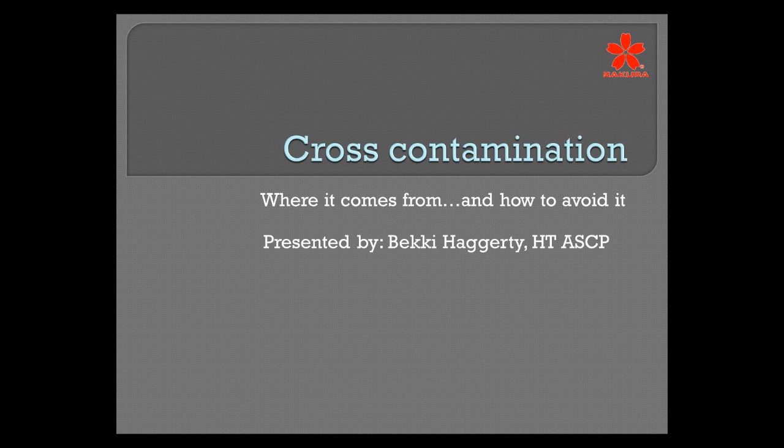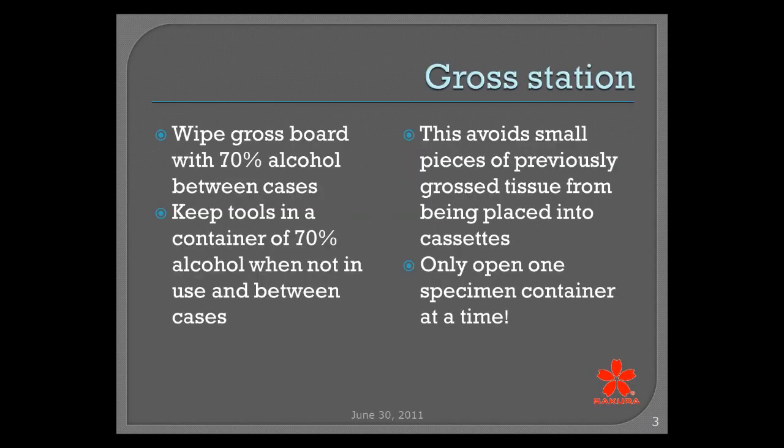I'm going to talk about cross-contamination and tips to avoid it in the histology lab. So we're just going to go station to station, and we are going to talk directly about those stations and small little things that we can do to avoid cross-contamination.